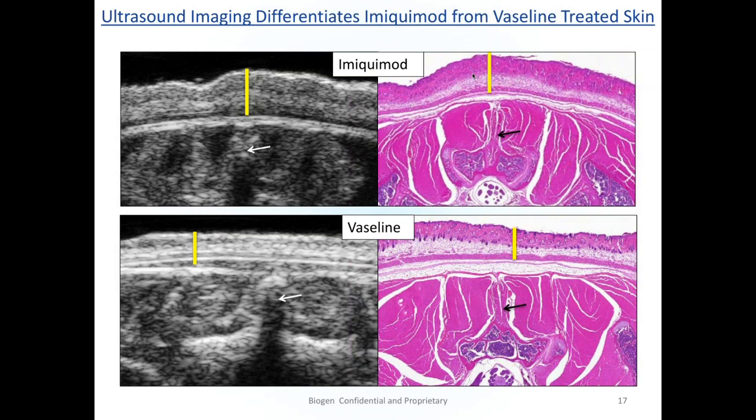There's another question here. Hair has repeated periods of very intensive growth. What specific postnatal days are better for your mouse strain? We didn't do super young mice. I think the youngest we did, in the TSK mice, were about 5 weeks old. For the most part we were working in at least 6 to 8 week old mice and then older. So we don't know about early development. We didn't get into that piece, so I can't really answer that.